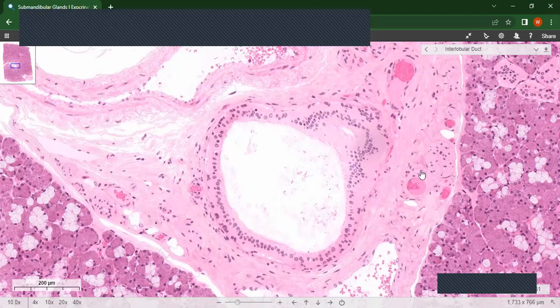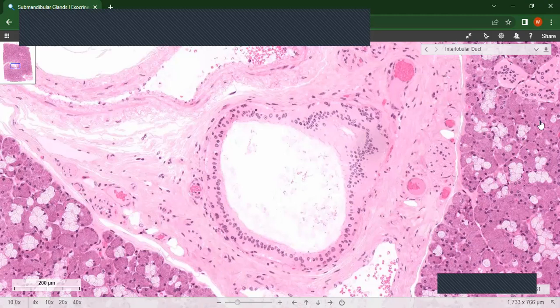This is a capillary here. All of this is the septum from the capsule — the ducts are located within the septa. Here you can see a mucous acinus with a serous demilune over there, and these are the serous acini. These are the striated ducts; several of them drain into the interlobular or extralobular duct.